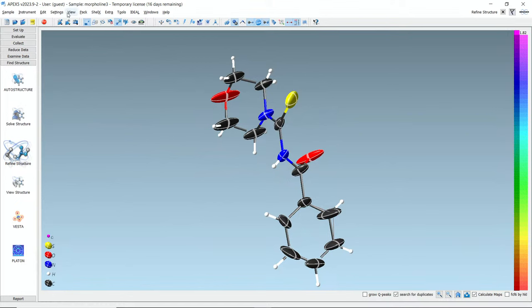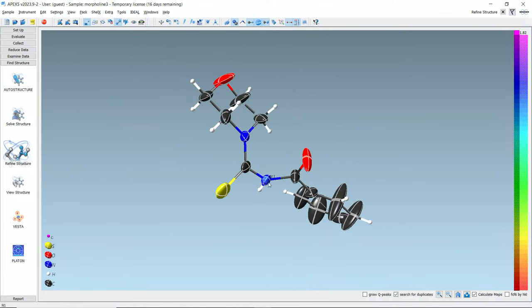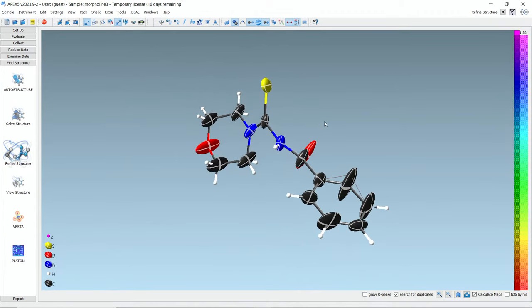So is that thermal ellipsoid really so elongated? Yes. It should be more uniform, right? Yeah, it should be a nice round ball. You know, this one, like the end here. Yeah. So when you look at the modulation functions, this probably doesn't have a large modulation function. These here will have a large one.